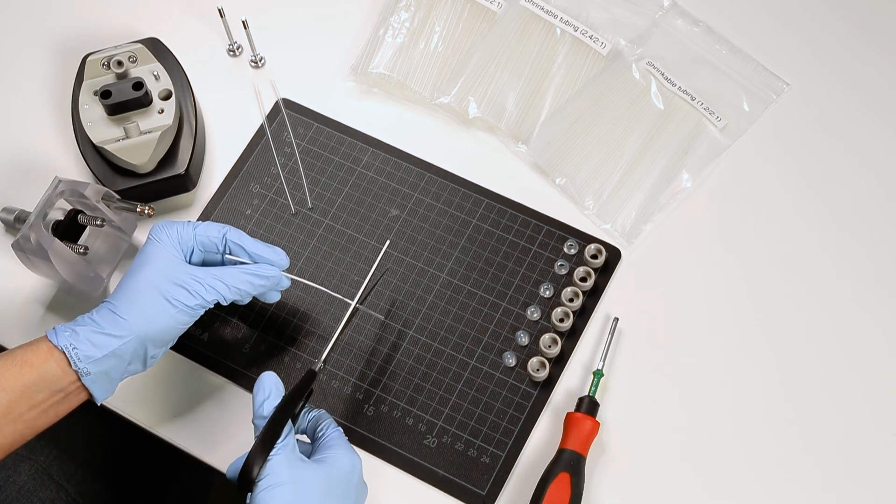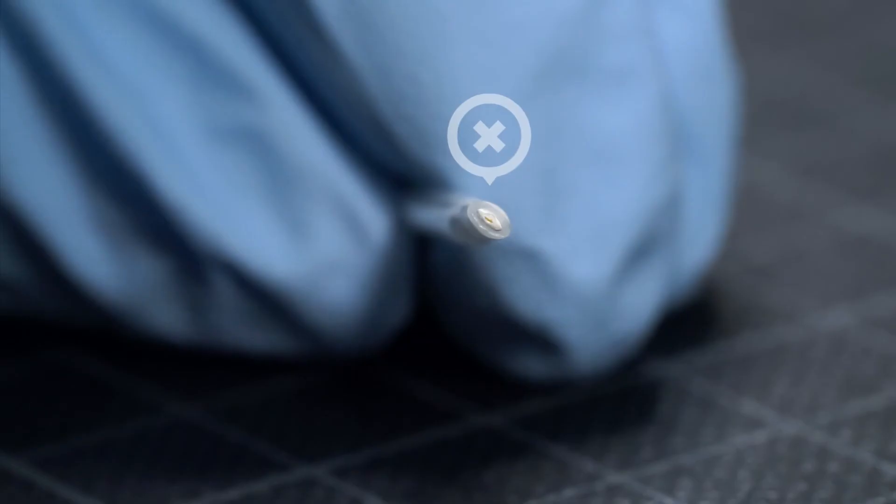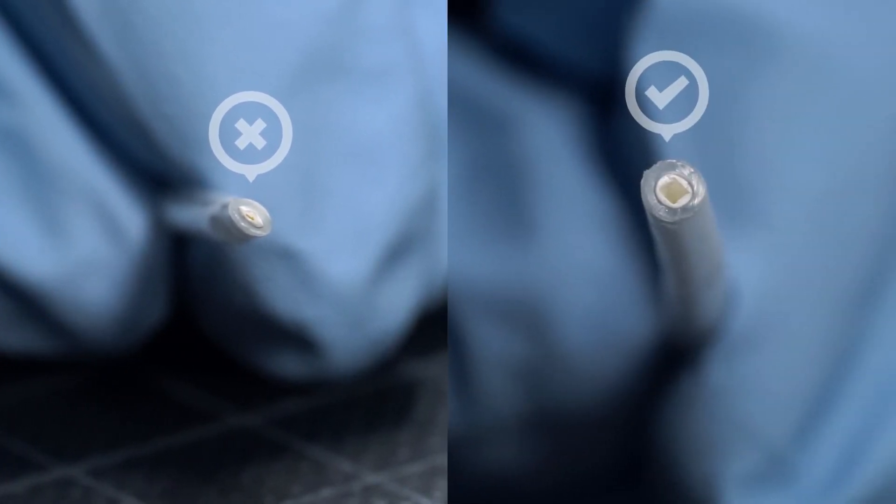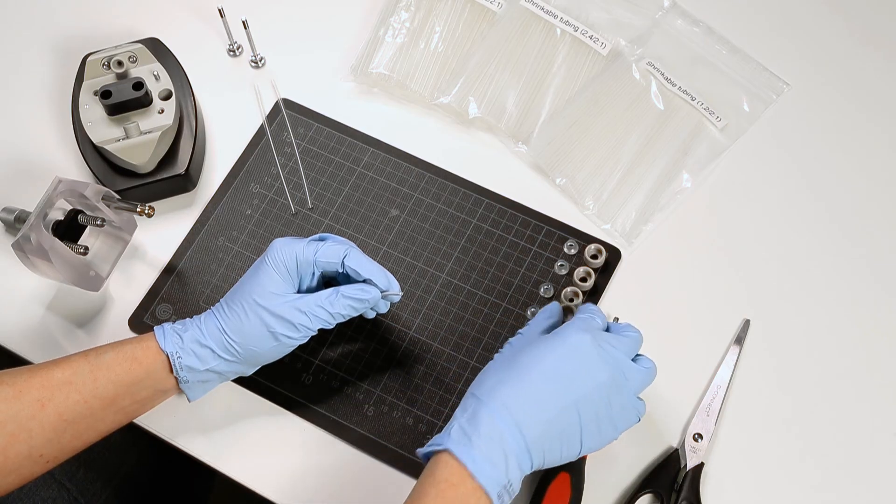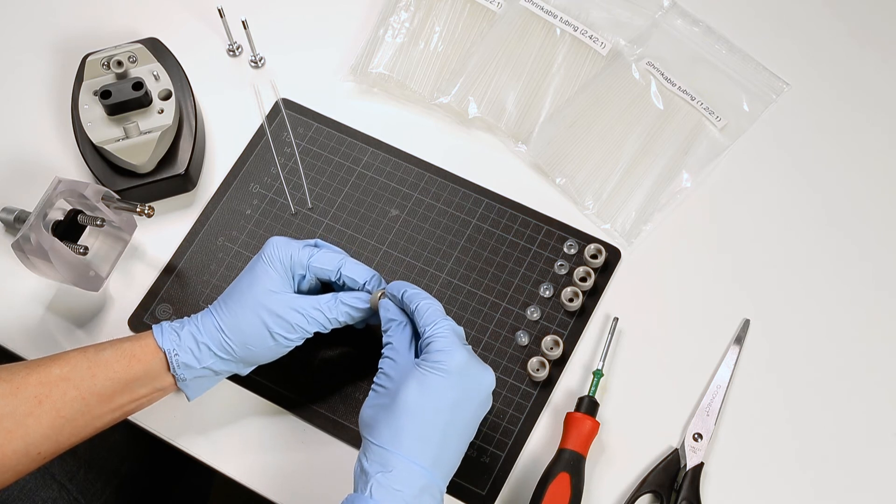Cut one end of the heat shrink tube with the hollow fiber membrane carefully in order not to squeeze the membrane. Now you can assemble the measuring cell in the same way as for tube samples, as shown earlier in this video.